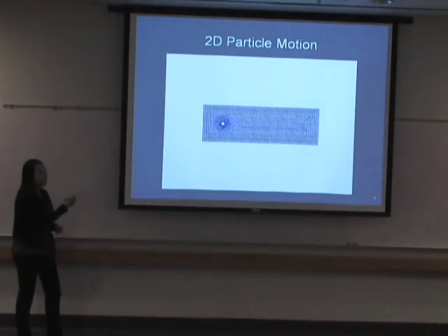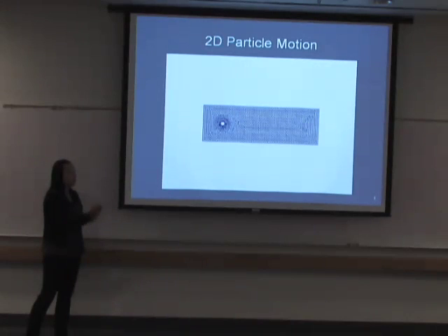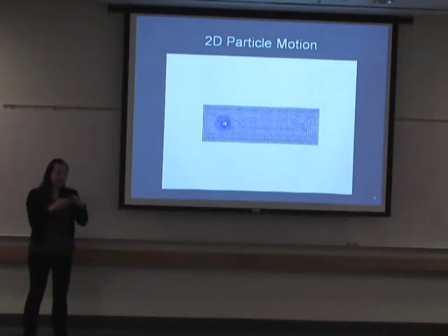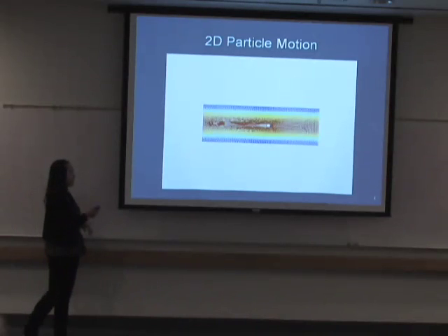This is also a really good example as to why we need dielectrophoresis. If we're watching this under a microscope and you add fluid somewhere to the left that pushes the particle and all of a sudden it accelerates to the right, your microscope only has that set field of vision. If it's out, you can't see it. You have to adjust it every time.